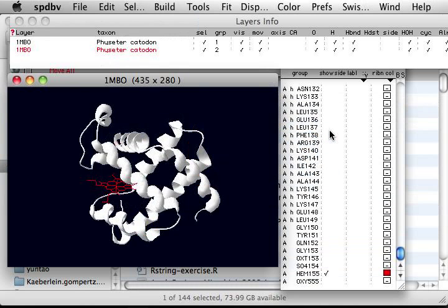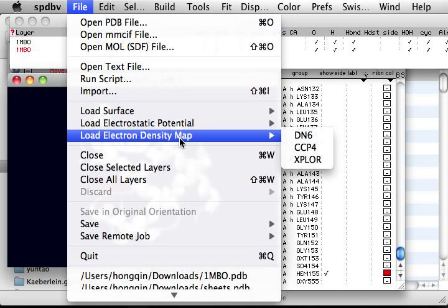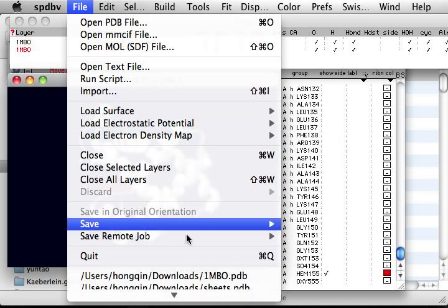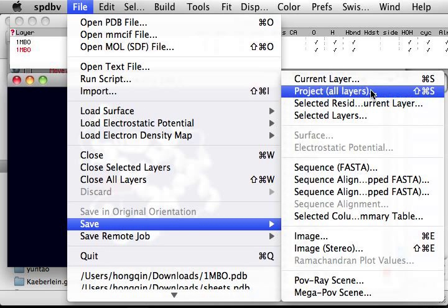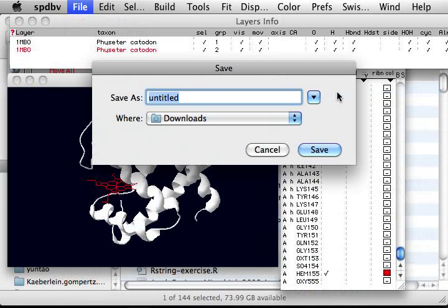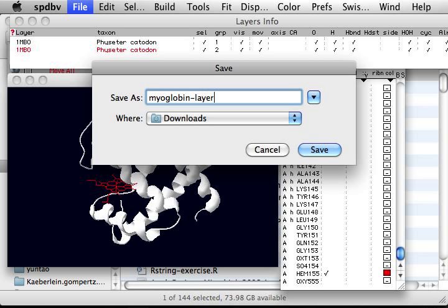You can also save your working file here. Save layers, project all layers. That's called myoglobin layers.